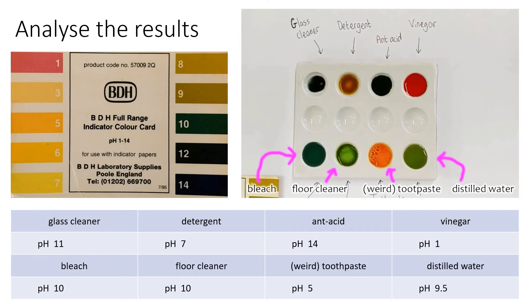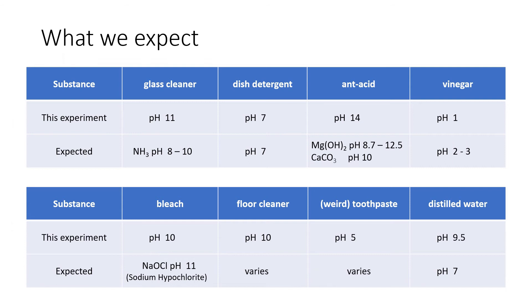So, the results are a little bit strange. Let's compare the results to our values that we would expect to see. For the glass cleaner we would expect ammonia, which is a very common substance used in glass cleaner, to be somewhere in the range of pH 8 to 10. So this result was okay, possibly slightly on the not that okay side of things. The dish detergent was exactly like we expected, so that's a great result.